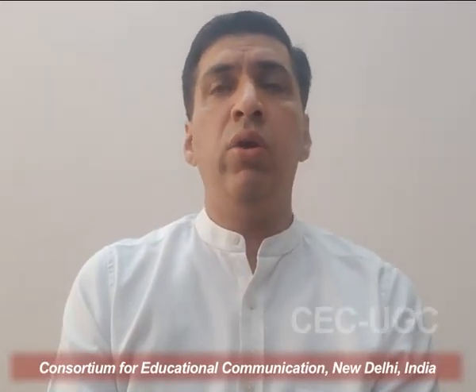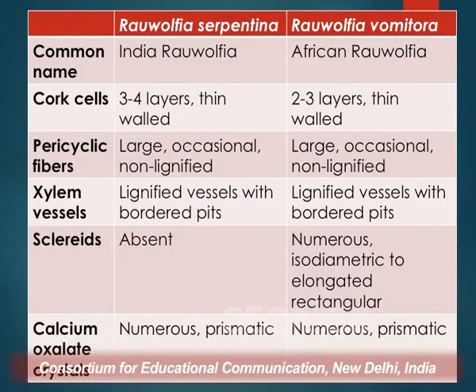Now, if we look into the qualitative microscopic characters of these two root drugs on the slide, the majority of the microscopic characters are the same. So we can also say these qualitative microscopic characters help in differentiating not only morphologically similar drugs but also microscopically similar drugs.